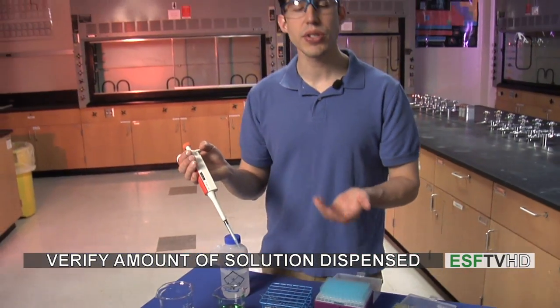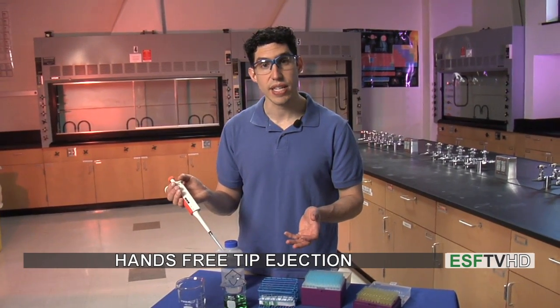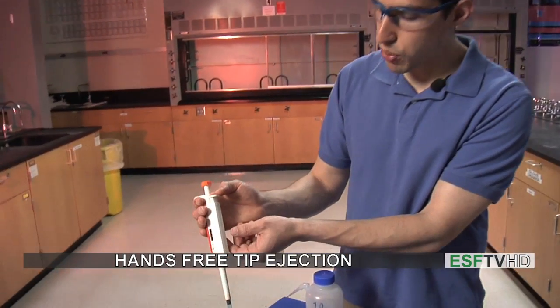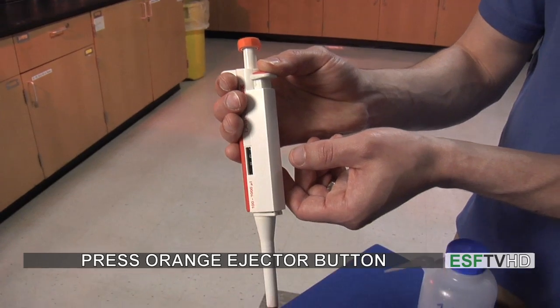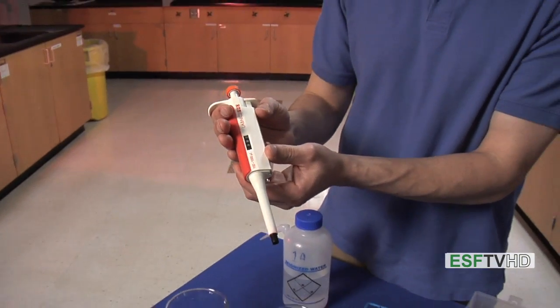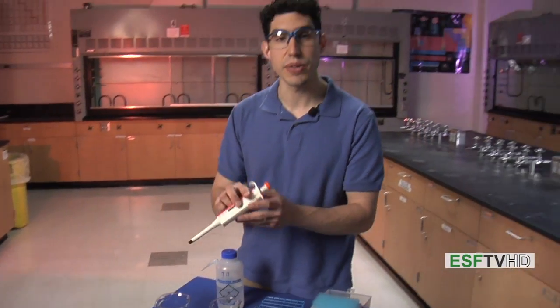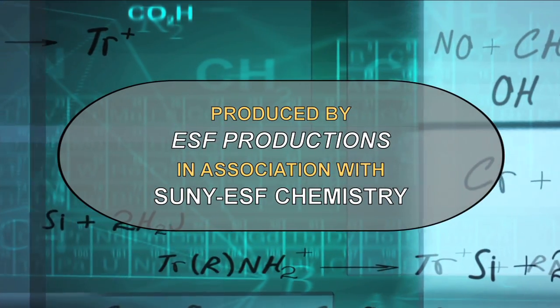When we're all done using the micropipette and done using the solution, we can eject the tip — and again, that's a hands-free operation. I'll go to my collection beaker, and if I push down on this orange button, we'll hear a click as it ejects into the beaker. We now have a clean micropipette ready to go for the next volume dispense. And that is how you use the micropipette in the lab.